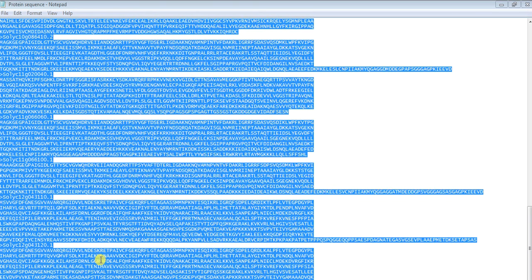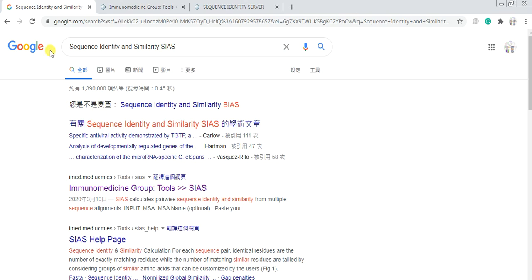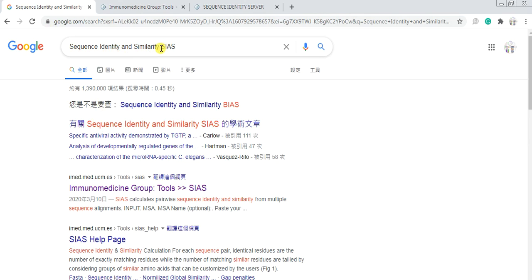Now open your browser in Google, write sequence identity and similarity, S-I-A-S, and open this link.